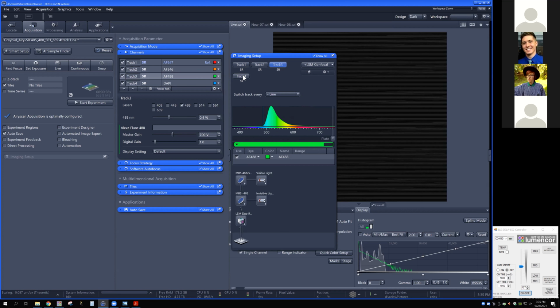So even though these emission signals overlap, right? This DAPI curve here clearly encroaches on the green and even onto the red to some extent. That's not an issue, actually, with this kind of line switch configuration for Airy Scan. The killer in this case comes in if you have excitation overlap, which is important to think about as much as emission overlap is. So if we have excitation overlap, which means if this 561 laser excites anything else, if it excites your far red, for example, then you're guaranteed to collect this because you have no protection on the emission side of this hardware setup.